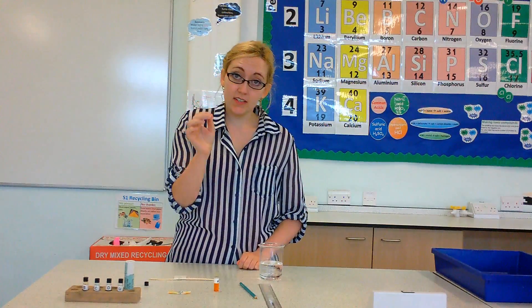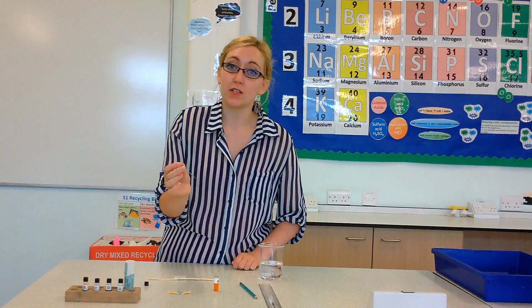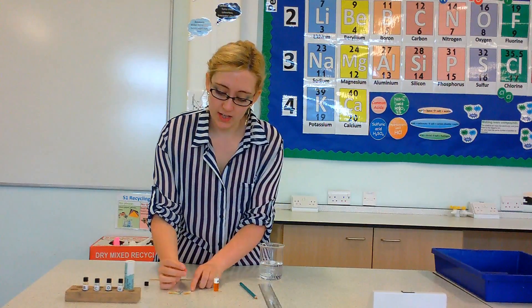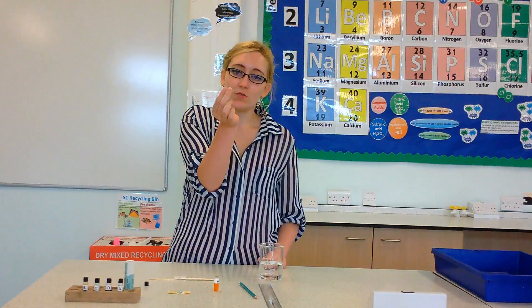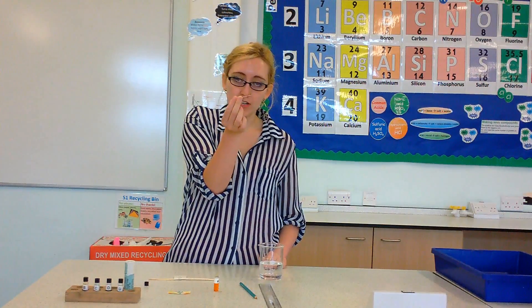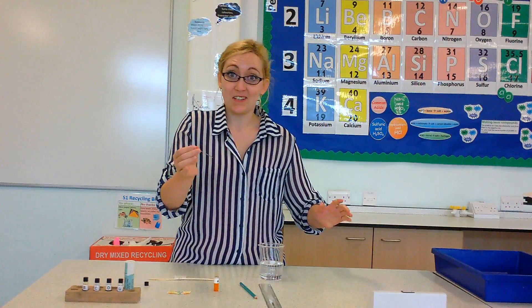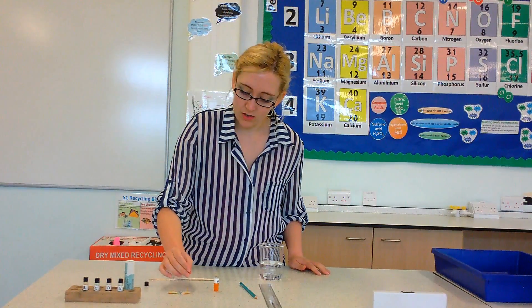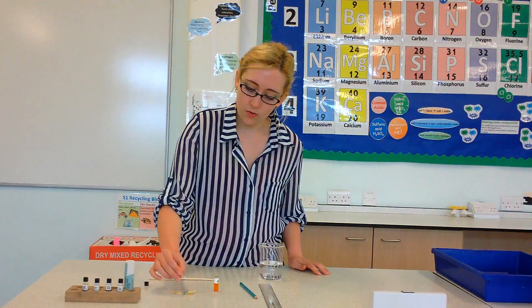Then for the merest, briefest time possible, you just touch it to the filter paper where you want the ink to come out - very, very quick and off it comes. To clean the capillary tube, you just get a different piece of filter paper and dot around getting all of the ink out of your capillary tube.